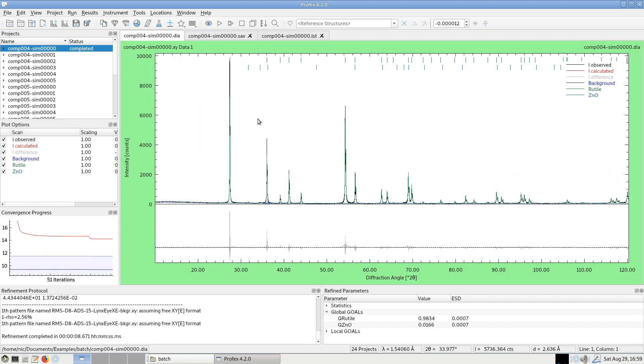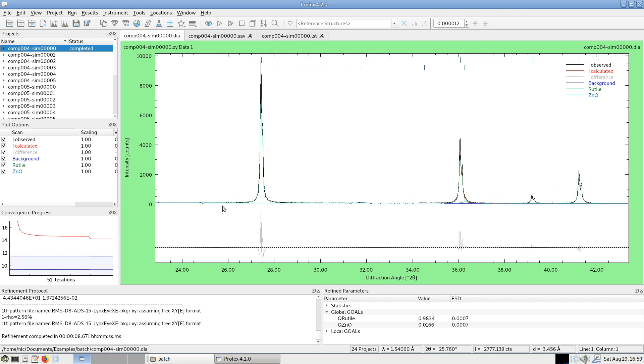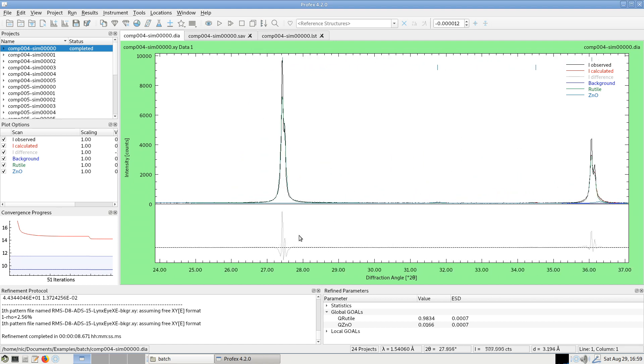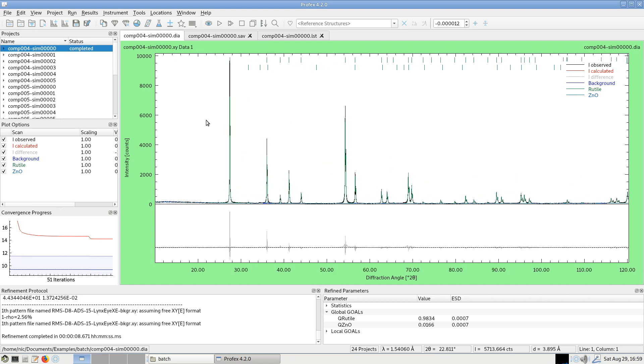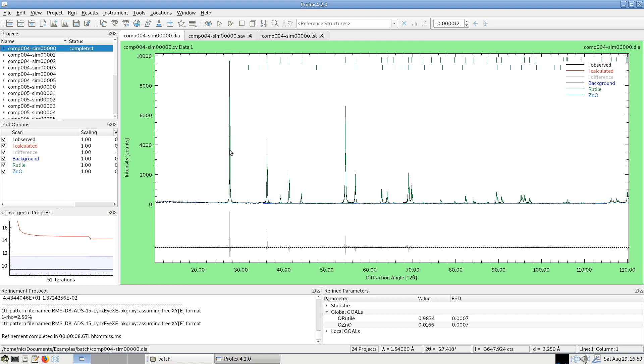Now I need to optimize my refinement strategy. The fit is not yet very good. We can see some pretty strong differences in the difference curve, mainly in intensities. So I will continue as we have learned in a previous episode of the tutorials. I will just optimize my profile refinement of mainly of the rutile phase until I get a really good fit.